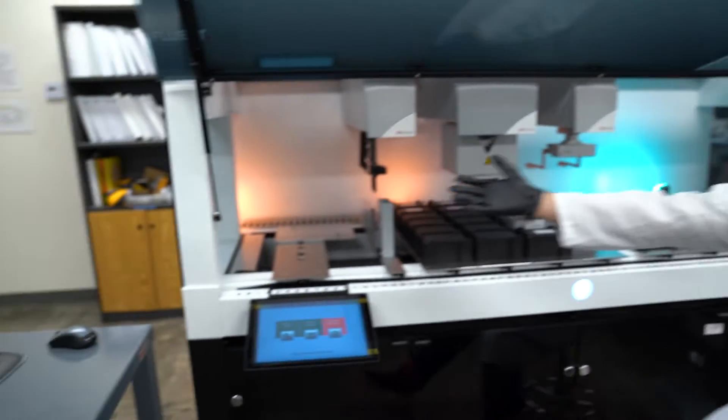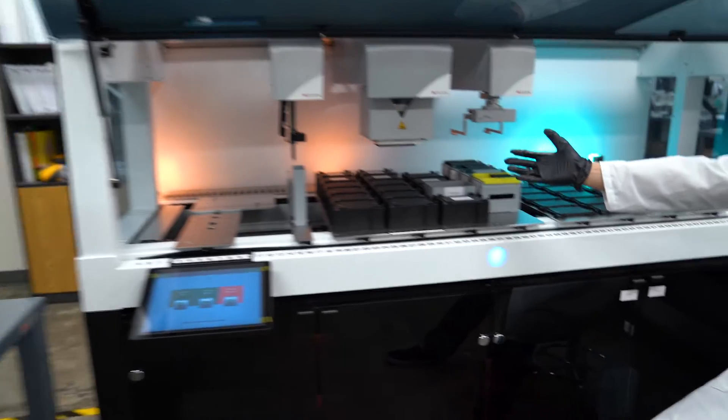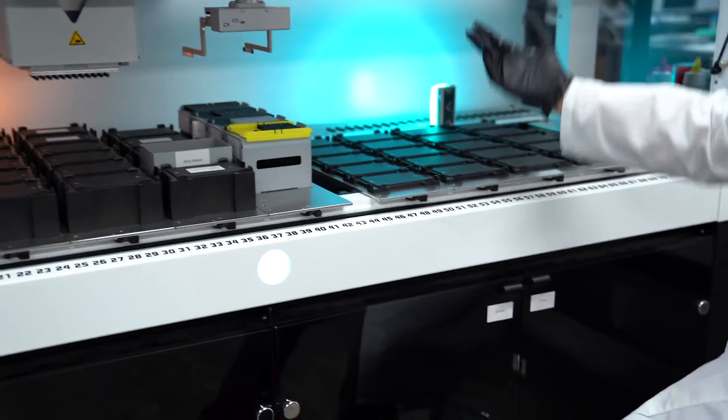So I'm going to show you how to get into a work table, what a work table means, and how do you manipulate a work table. All a work table is, is a graphical representation of all of this.